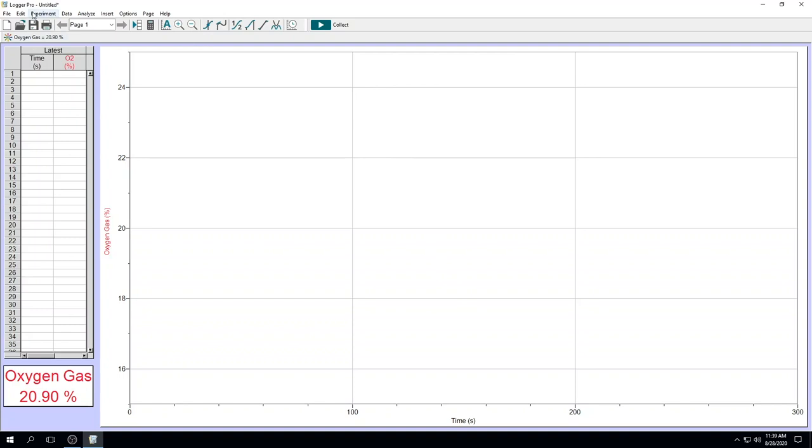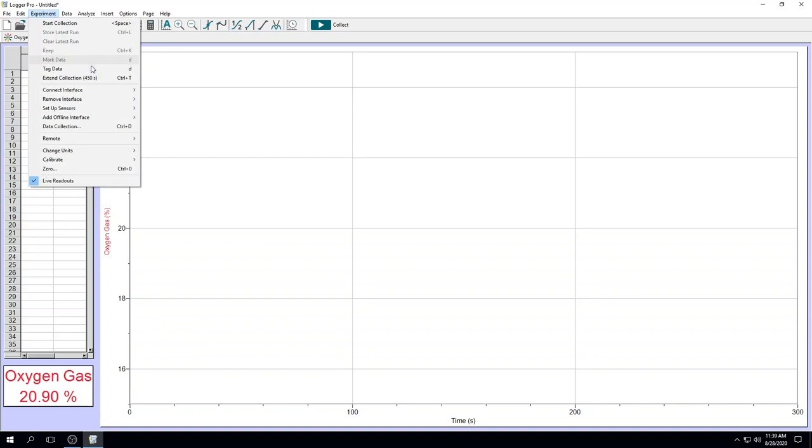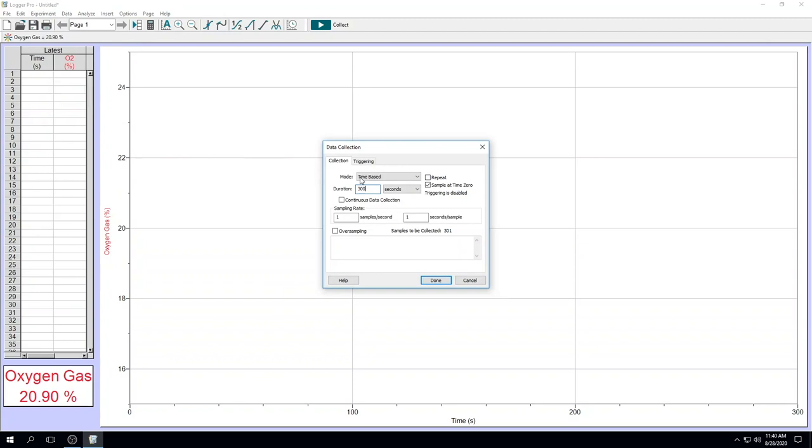Step two, you want to change the durations of data collection. In experiment, data collection, for the durations of 30 minutes, one sample per minute.